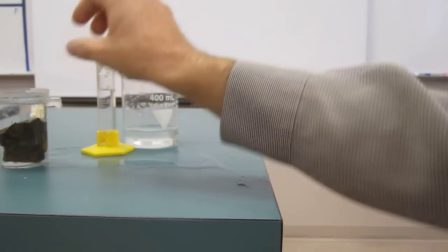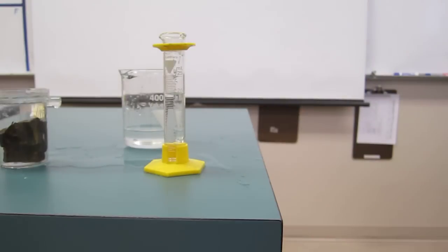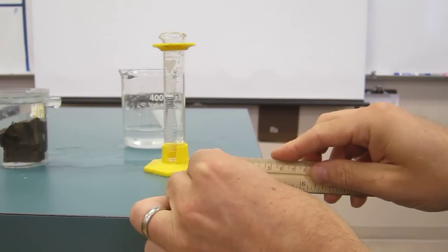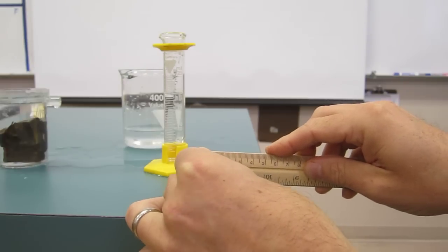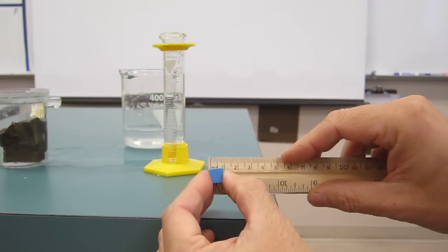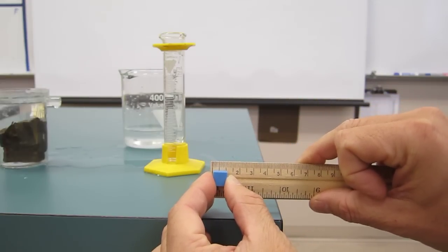Last thing I asked them to do was to use the blue cube over here and measure its volume the old-fashioned way, which is just length times width times height. And you'll see it has a length of 1.0, has a width of 1.0, has a height of 1.0. Oh, you can't see where I'm blocking that. So I'll just show you one more time here. There, it has a width, length, and height of 1.0.